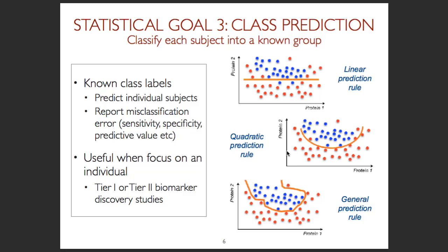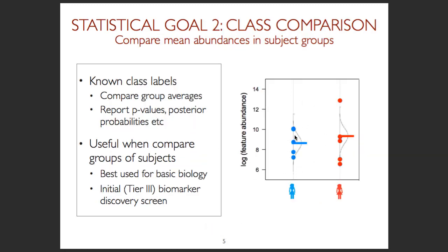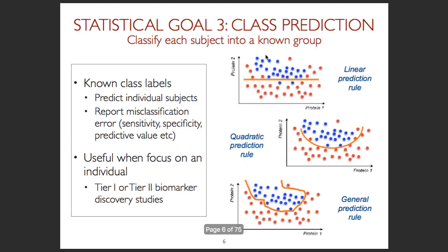So, and there are several things, right? So on one hand, you need to decide what are the analytes, which are even candidates, right, for you to consider. And on the other hand, is the biological samples on which you would need to see how they perform. So usually the methods like this require less number of biological replicates than methods like this, because it would probably take less information to be very confident in averages as opposed to being able to characterize each individual subject.